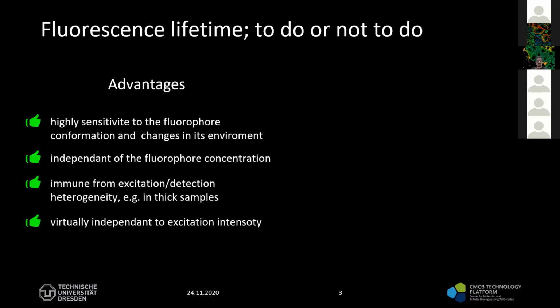Fluorescence lifetime measurements are immune from excitation or detection heterogeneity, especially in thick samples. They are also virtually independent of excitation intensity. Okay, questionable, we'll talk about that.